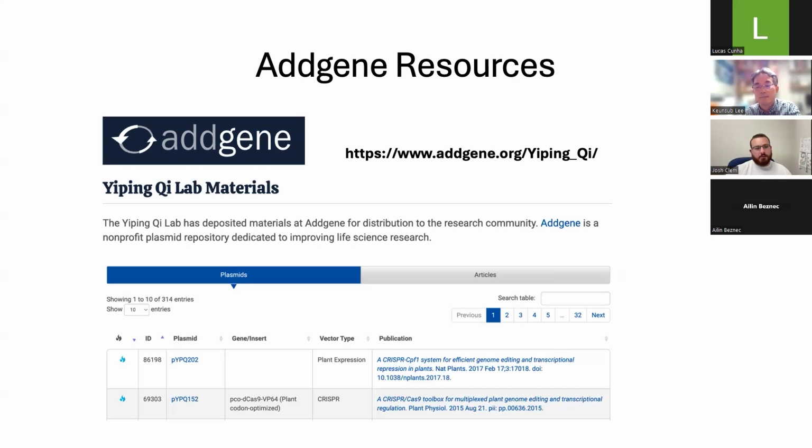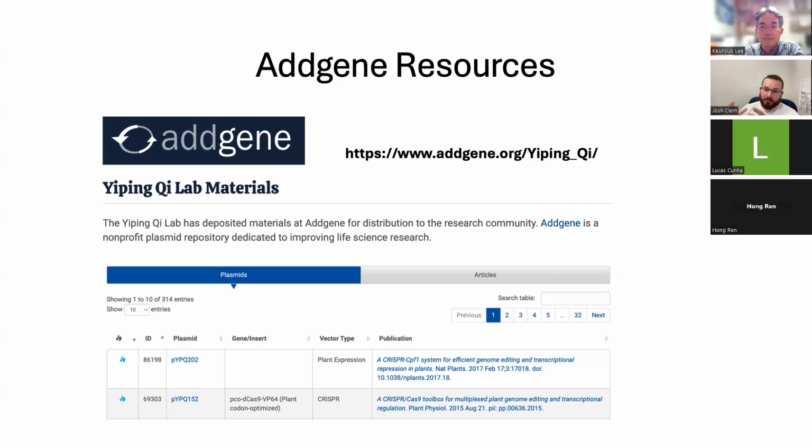It is, yeah. There are probably faster ways, but we opt for this because we're often screening a lot of plants, and we're also interested in assessing the editing efficiency at the molecular level, right? Not just based on phenotype. We're interested in looking at the zygosity, the level of mosaicism or chimerism. And we can best do that and most efficiently cost-wise using amplicon deep sequencing. So we send our amplicons for Illumina sequencing.